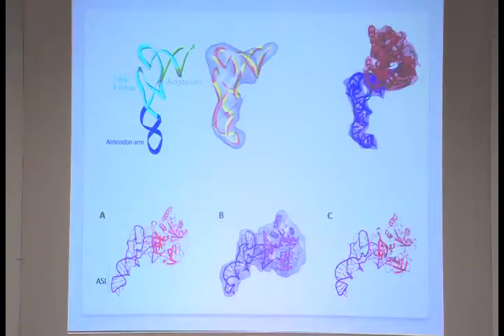So tRNA is a really very flexible molecule, and when it reads the codon, it actually bends its anticodon arm. In this structure you could really see how each base and its modifications are placed and how they are interacting.